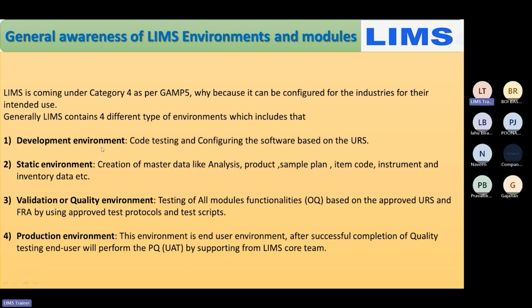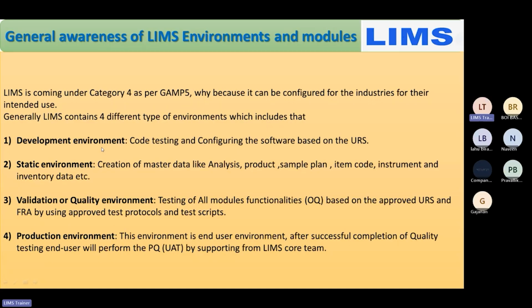For example, different guidelines, SOPs, or specifications will all be recorded first as the brain of the LIMS software. By referring to them, suppose one product is there and an analysis test is required; that test will be created by following this master data only. How this static environment is developed and created, I am going to explain in further lectures.